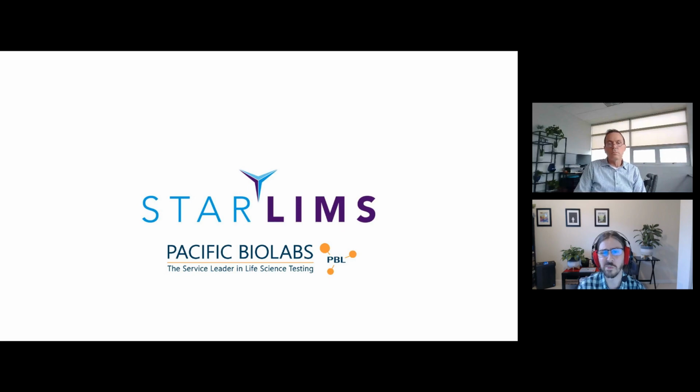And by that, I mean you just need to know what a variable is, what a function is, and what a parameter is. And pretty much that's it. If you can understand those core concepts, which you could teach yourself within a week, you can make a test case using our framework. The core framework does require more advanced JavaScript knowledge, as if you were a developer. But the way that we designed this is that hopefully you don't have to touch that part of the framework. We've created it so that it will just work.